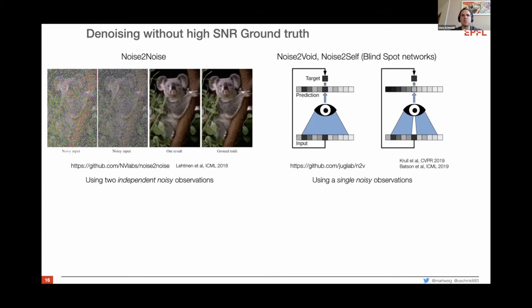And so it's the same conditions, right? And sometimes if it's moving too fast, then Martin's going to speak about Noise2Noise now, where even if you have two paired low SNR images, you can still work with that for denoising. So in your live cell imaging situation, it may not be possible to use a long exposure because the sample moves too quickly, but even then you can do this. And I think, yeah, Martin's going to talk about that now.